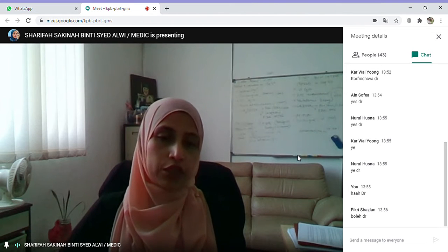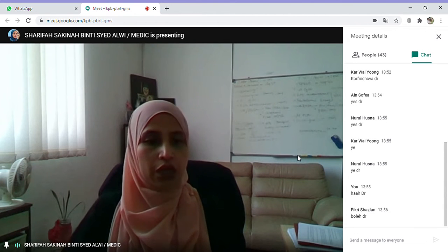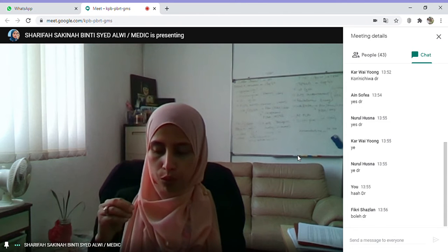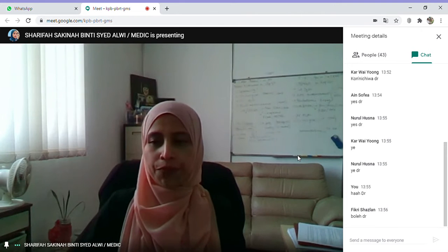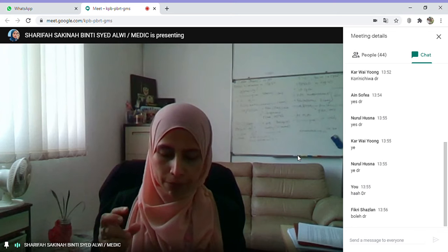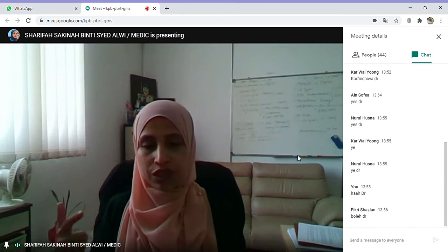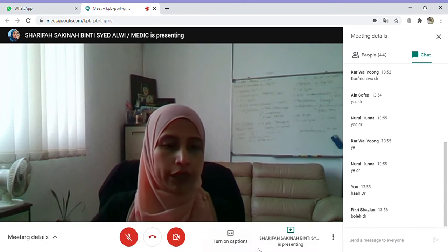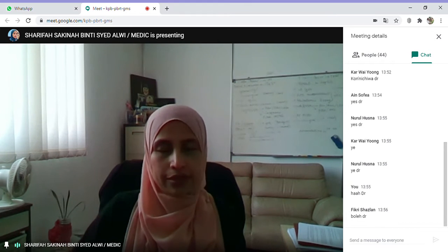So this is the unique ability of the flow cyto. It can analyze thousands of cells, simultaneously measuring multiple antigens. As I mentioned earlier, when you talk about multiple antigens, measurement of antigenic properties, macam I kata tadi, they involve staining cells. So the cells have to be stained before you can run through flow cytometry. It can also measure different properties of cells, able to categorize and quantify.